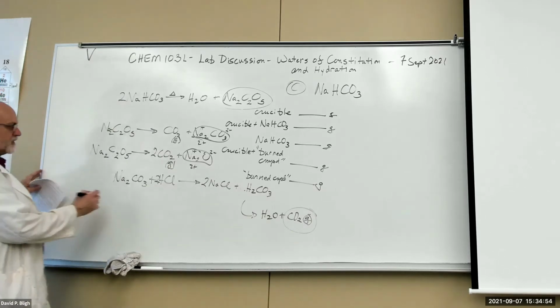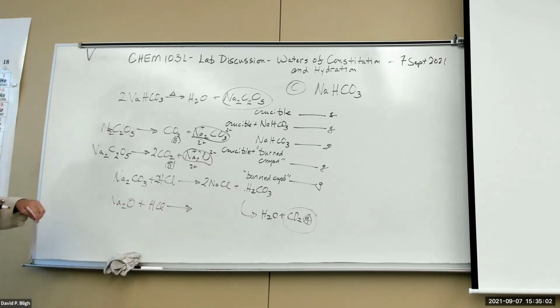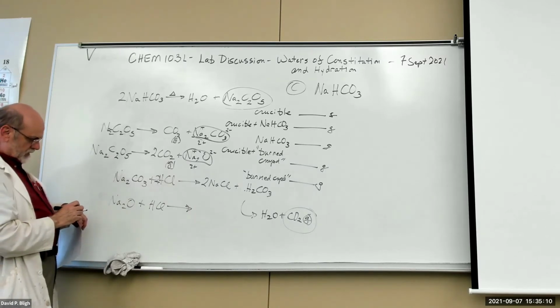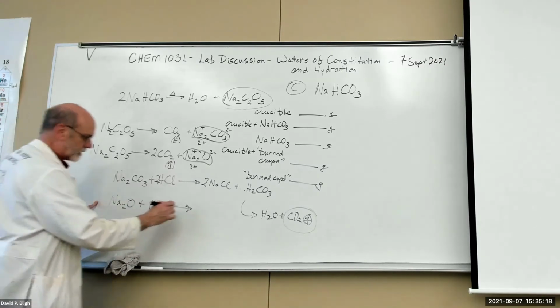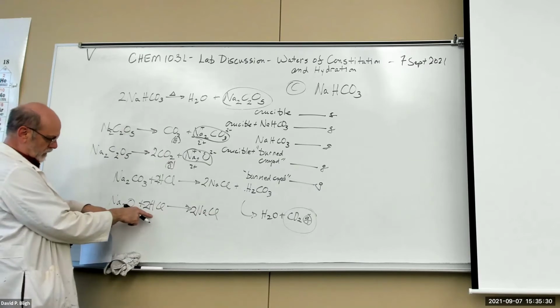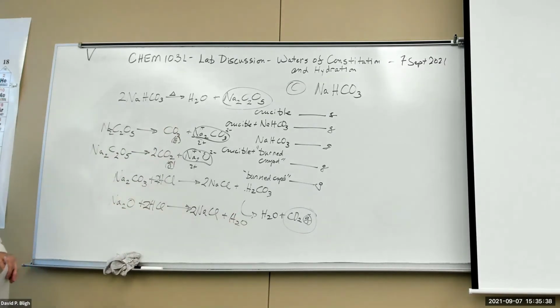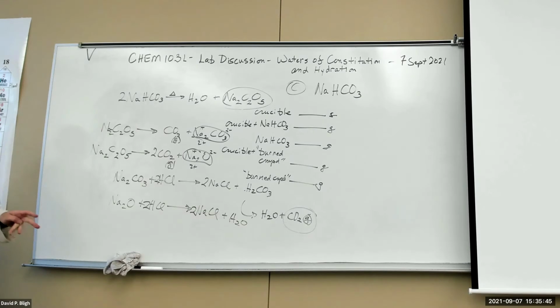So what if we add acid to this one? Na2O plus HCl. Okay. Well, how's it going to make a fizz out of that? Well, it can. This cation is going to combine with that anion, like that. But there are two of them, right? So we need two sodiums, which now we need two chlorines. So what's left over? Well, two H's and one O. It just makes salt water. No fizz. So if there's no fizz, then this is your product. Okay? That's the fizz test. That's the qualitative observation.